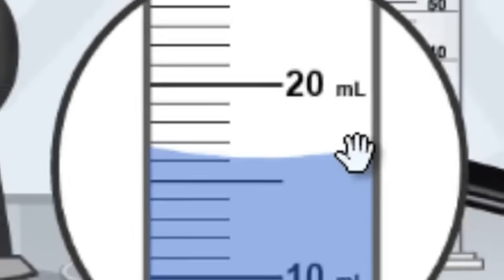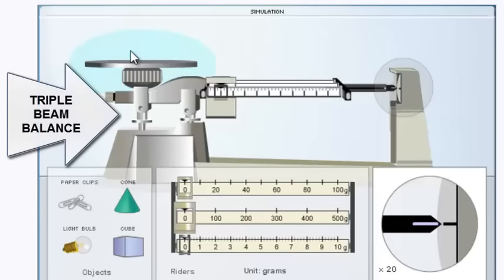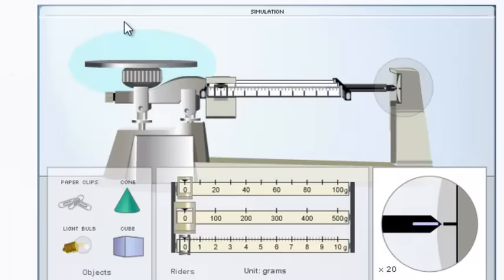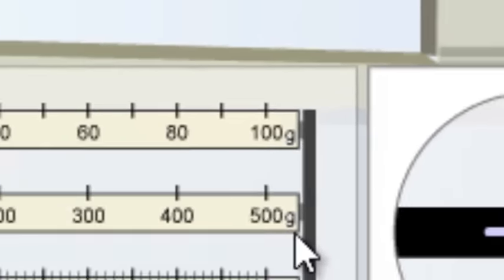Now let's take a look at how we can find the mass of an object. This instrument here is called the triple beam balance and this is what's used to find the mass of an object. If you remember from our video on density, mass is how much stuff is in an object or how much matter it has. So we're always going to measure that in grams. Volume is measured in milliliters or cubic centimeters, but mass is always measured in grams. We can do variations like kilograms and milligrams but we'll just stick to the basic unit of grams.